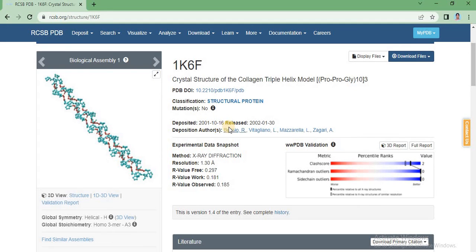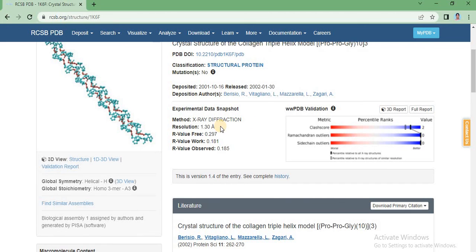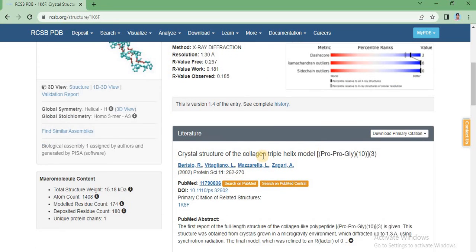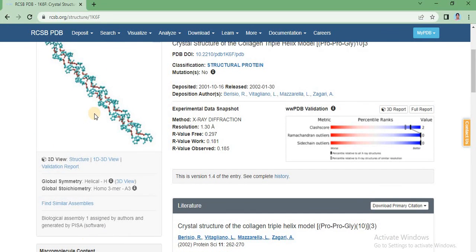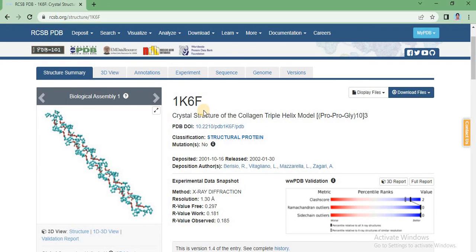Clicking the ID gives details about the protein structure. For example, 1K6F is the crystal structure of a collagen triple helix model. Each entry has its own ID and classification. There are no mutations for this entry. It was deposited in 2001 and released in 2002. The authors' names are listed, along with experimental data showing X-ray diffraction and its resolution. A wwPDB validation report is also available to review.